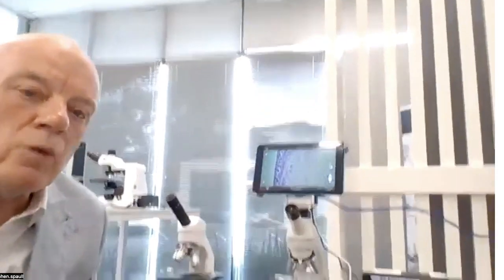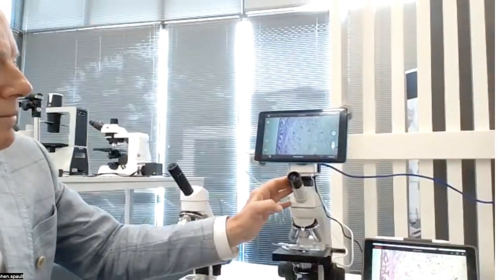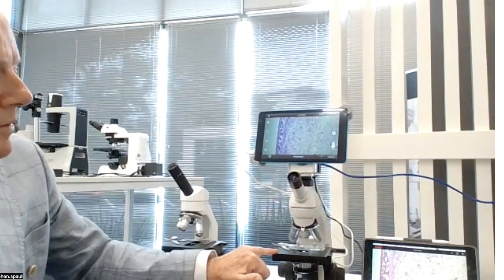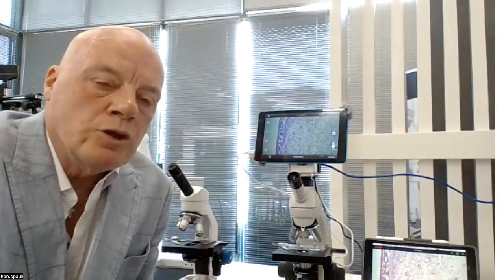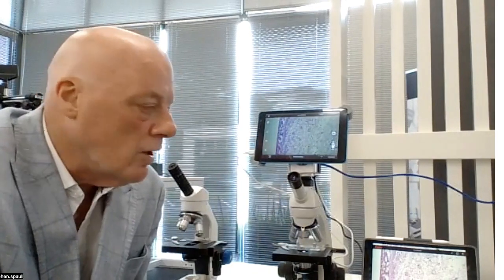So the first camera we're going to look at is a Wi-Fi camera, which is connected to the monocular microscope. At this stage, we've got an image through the eyepiece. Once you're actually looking at an image with a monocular microscope, you actually have to view the image through the eyepiece.